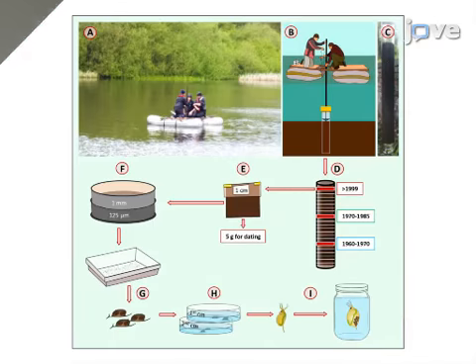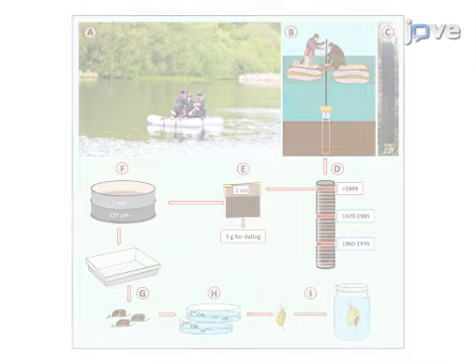Although the methodology of resurrection zooplankton species has been frequently applied, so far it has been propagated among laboratories only via directed knowledge transfer. Visual demonstration of this method will allow non-experts to apply resurrection ecology by following a step-by-step guide, promoting the application of a powerful technology to facilitate the study of evolution.